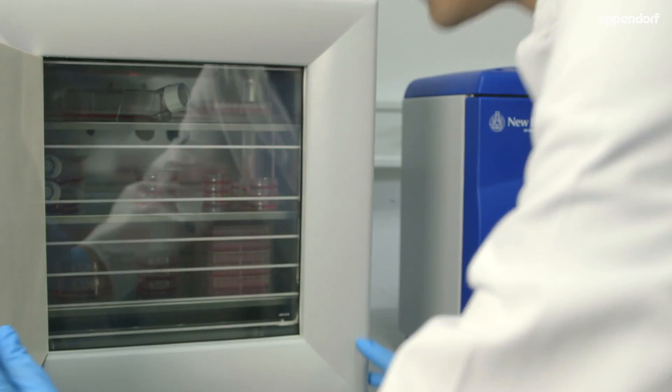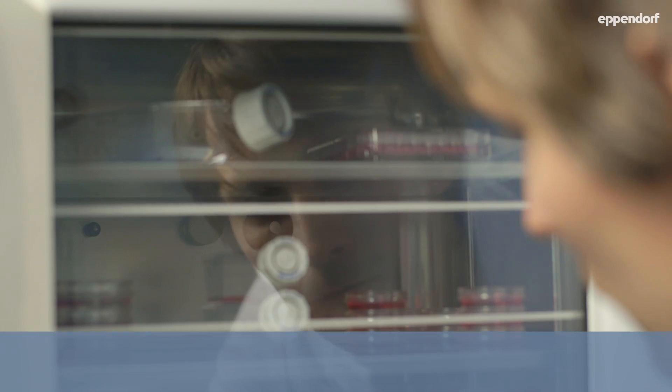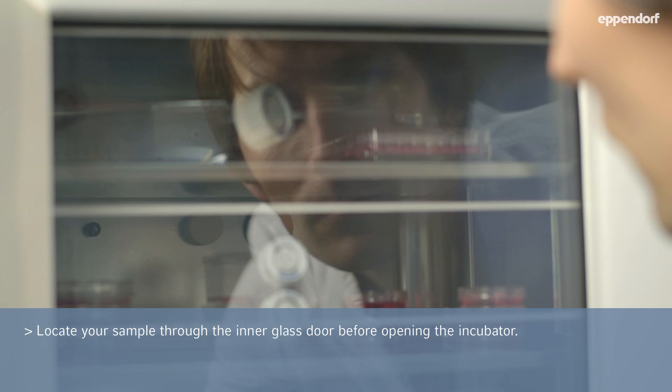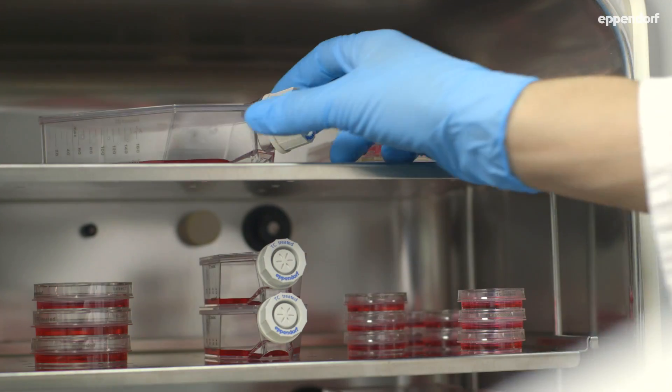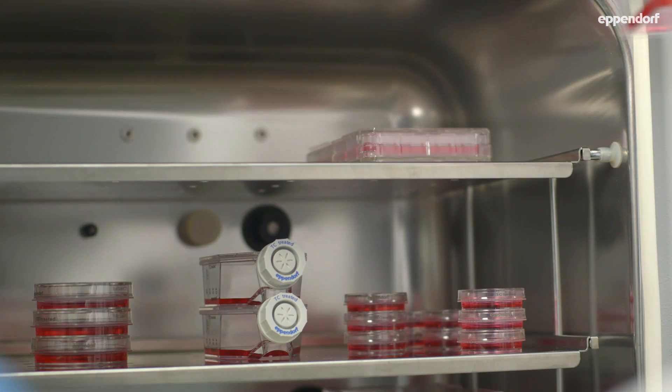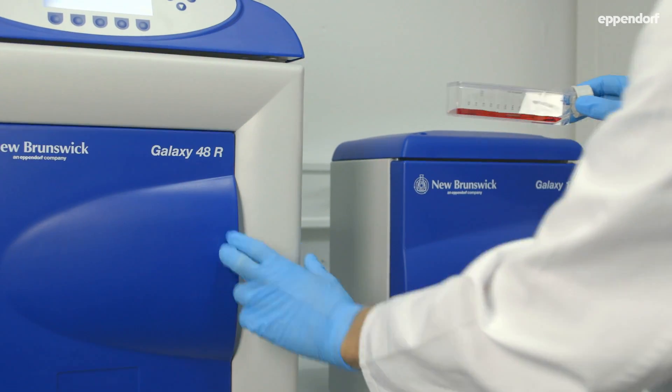Avoid leaving the incubator door open for long periods. An additional glass door not only allows monitoring the inside without disturbing the chamber environment, it also minimises the risk of contaminants entering the incubator.